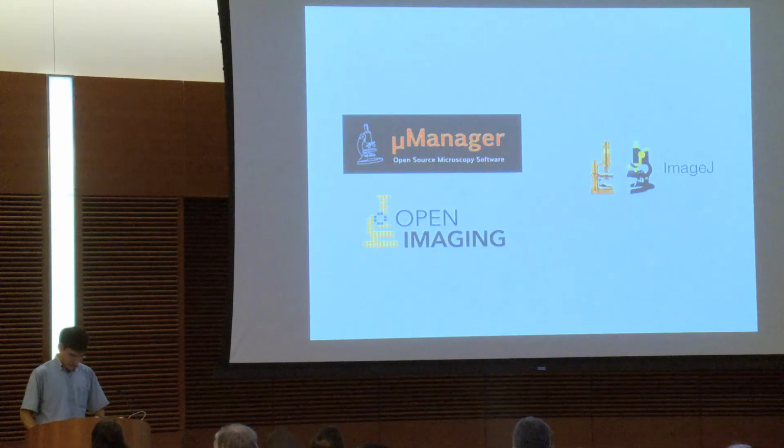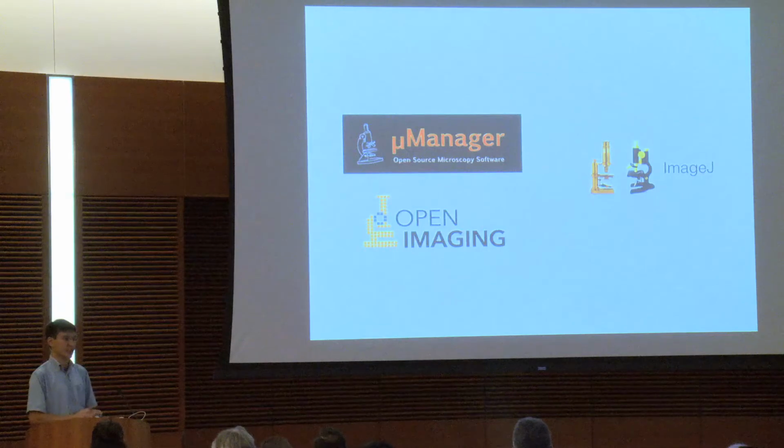And so I want to end on the note that we really view ourselves as a counterpart of ImageJ in the area of image acquisition.